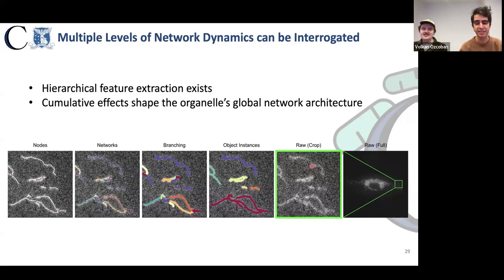And so using the MitoMimics segmentation and the analysis pipeline, we can extract features from raw image stacks, as shown here. And there's multiple levels of analysis you can conduct. So there's instance level object segmentations, which Aidan showed. There's also branch level subsegmentations we can do, network graph structures, as well as node positions. So here in red are branch nodes, and in green are endpoint nodes, which allow you to show and depict the evolution of networks over time. Here, I'll just focus on instance level temporal features, which reflect the direct consequences of fission fusion activity.